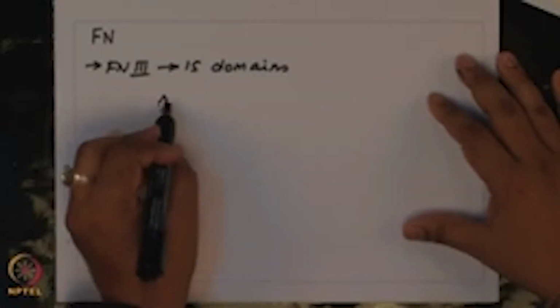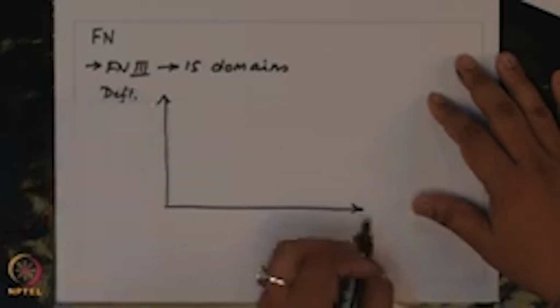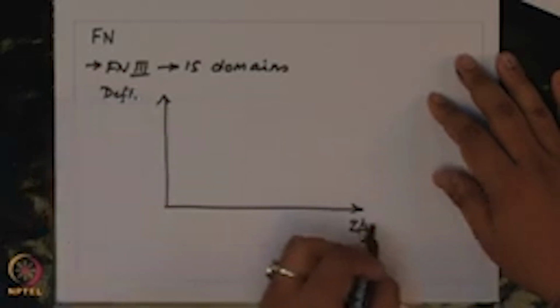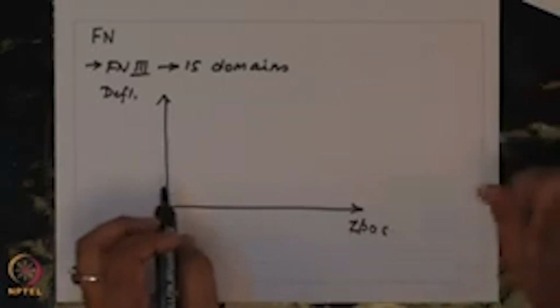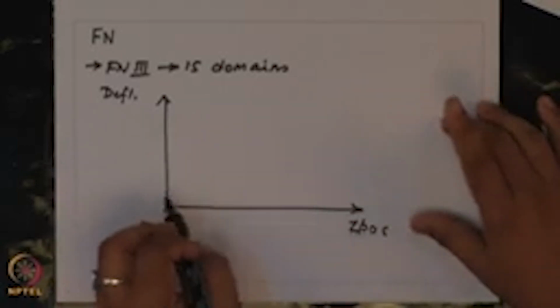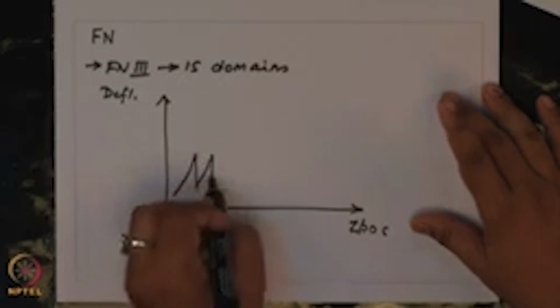If you pull this long a protein, you will get these multiple peaks.